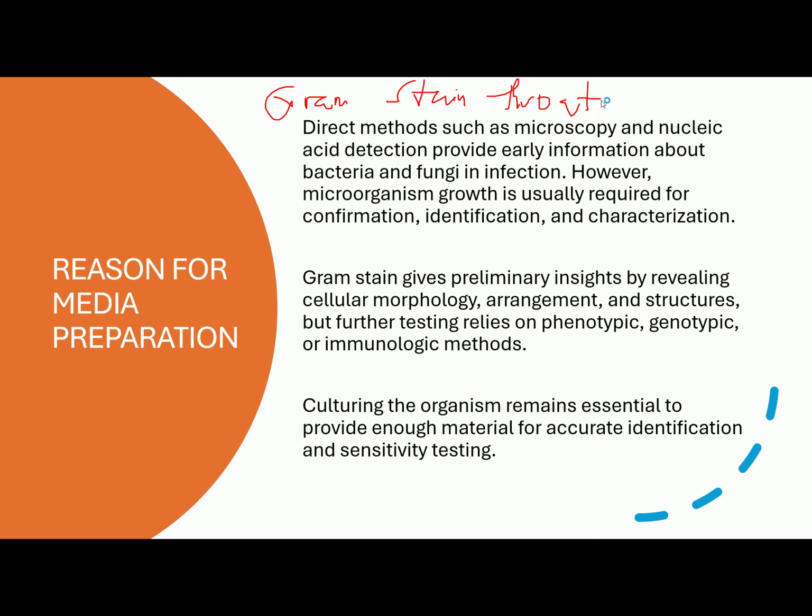Upon viewing the microscope, you were able to see different types of bacteria: Gram-positive cocci in chains. Some were in clusters, some were in pairs, etc.